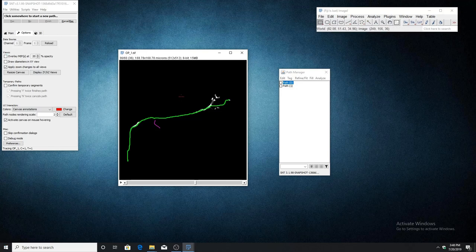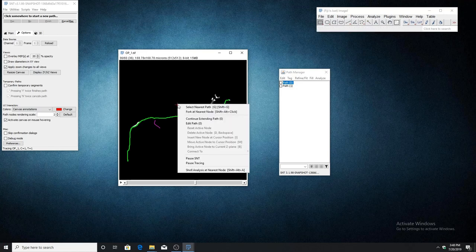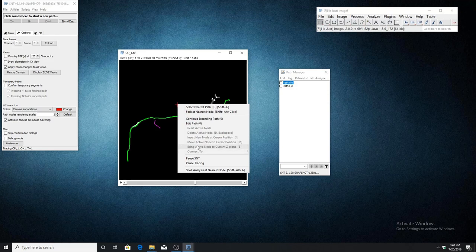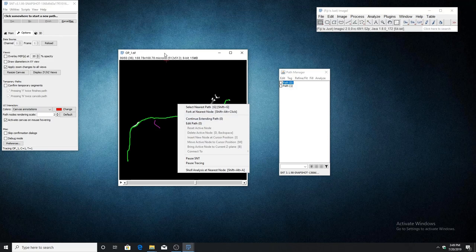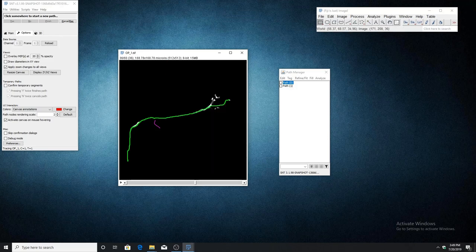Now I want to go over the functions that are associated with edit mode. You'll notice that these functions are currently grayed out, but once we enter edit mode, they will become active. To enter edit mode, first select the path that you want to edit.